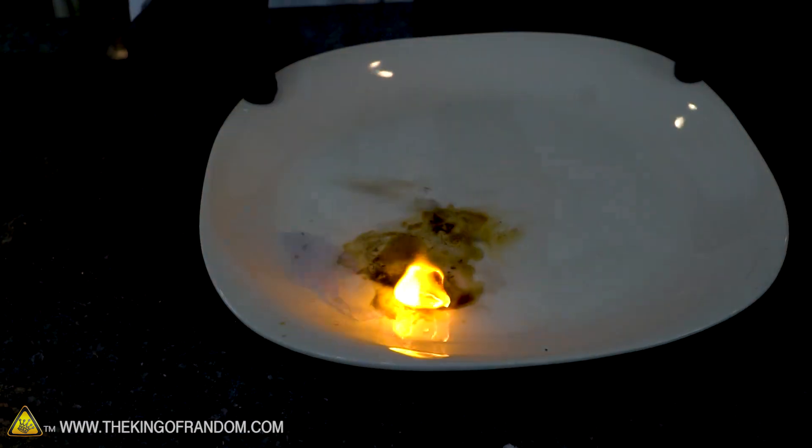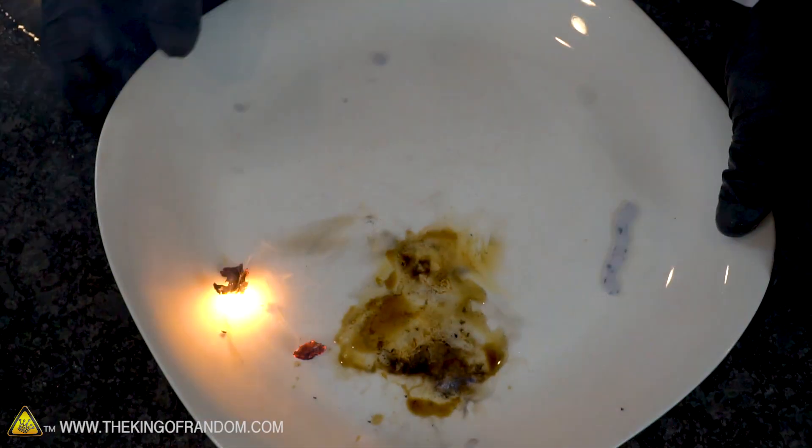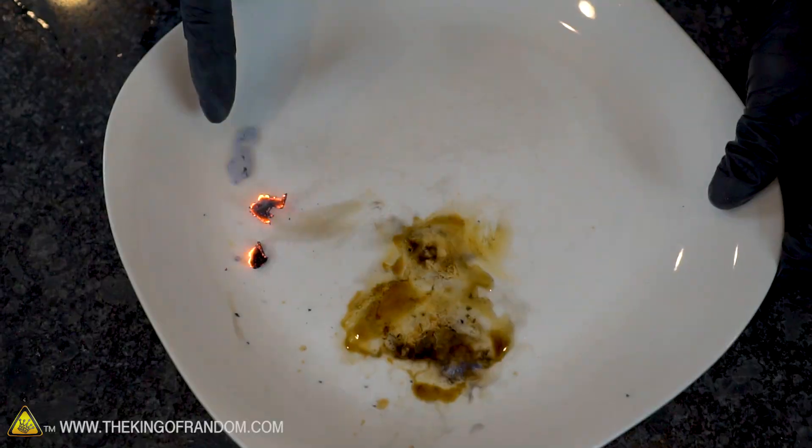Wow, you see that? When the oxygen makes contact it almost explodes every time it touches. Look at this oxygen here - it's just skittling around. It's got similar properties to liquid nitrogen - the Leidenfrost effect. Watch what happens if I tap it - and it goes into a million pieces.